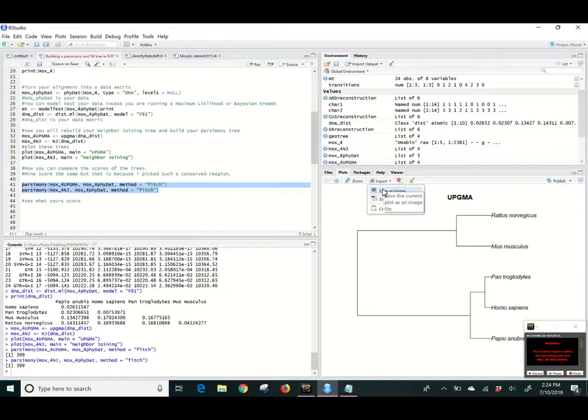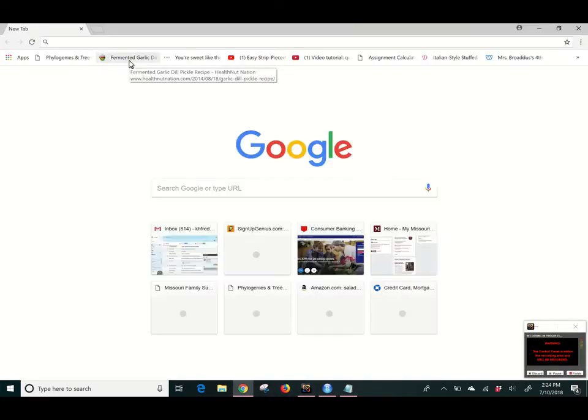And you're going to want to talk about the differences between your neighbor joining and your UPGMA tree. This is your parsimony tree. Now, if you don't want to build your neighbor joining tree again, you don't have to, because you should already have one from MUSCLE, so you can compare this tree to your MUSCLE tree as well. Okay, this is all you need for that assignment. Let me show you, just so we're all on the same page.